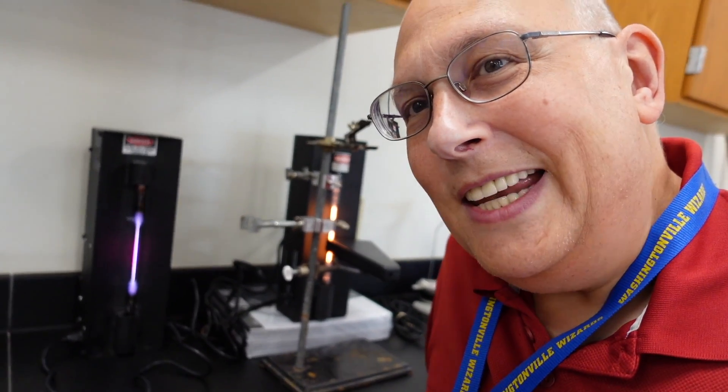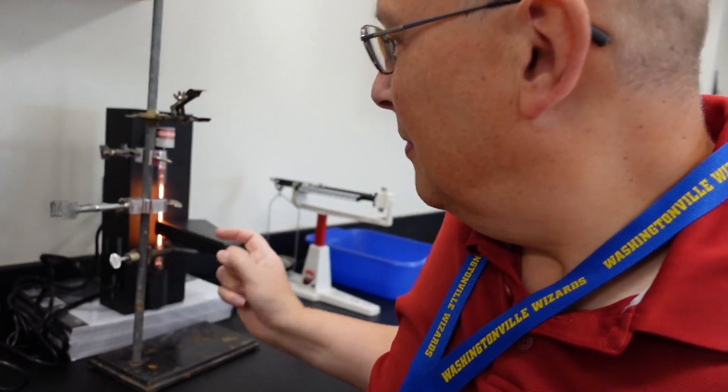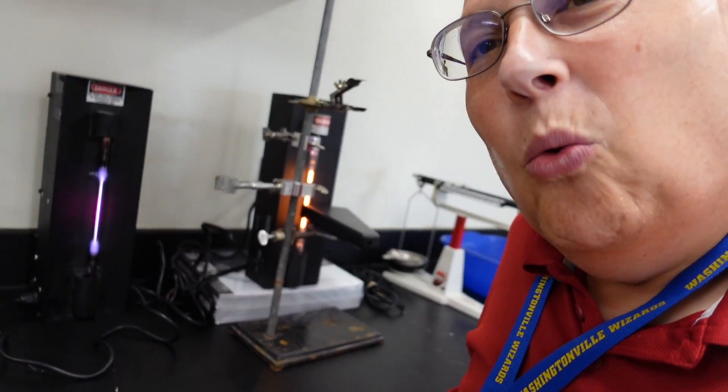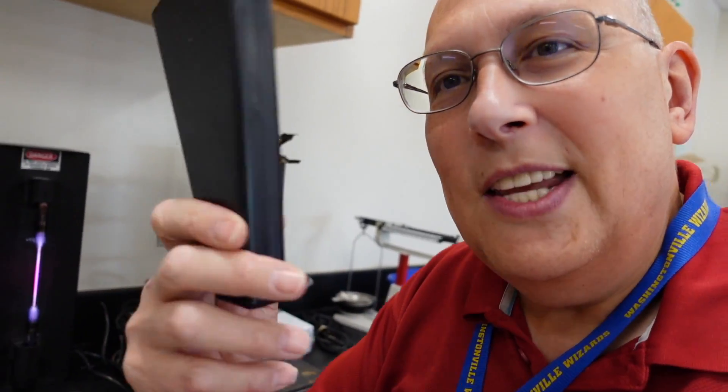Hey guys, so I'm sitting here with a couple of spectrum tubes that contain mystery elements. What are these elements? We don't know yet, but that's what you're going to find out, because you're going to use this device called a spectroscope to figure out what elements are in those tubes.